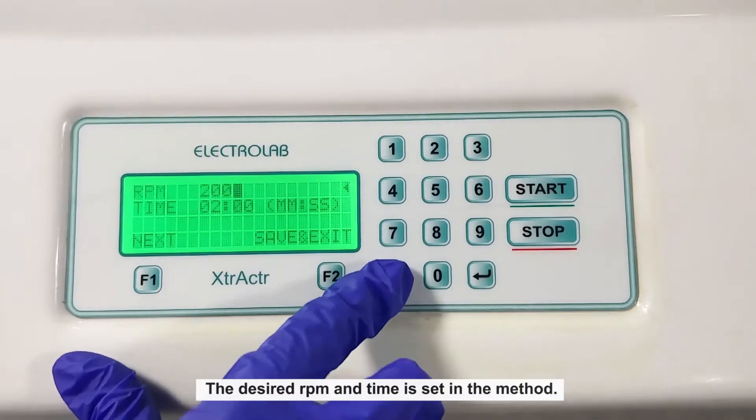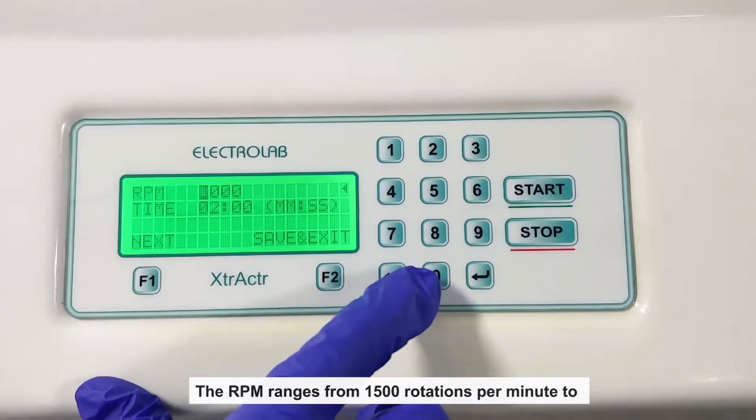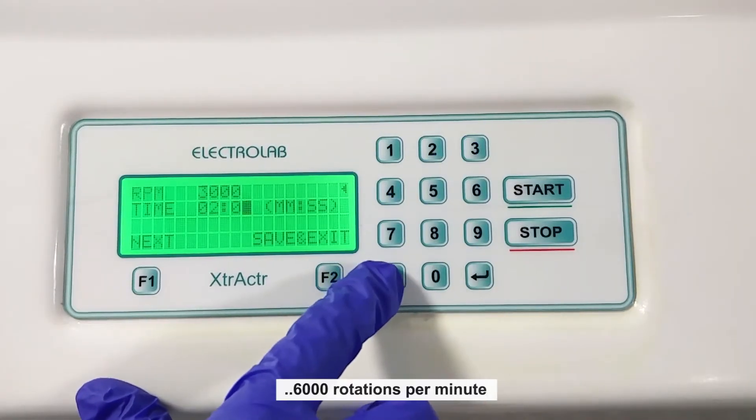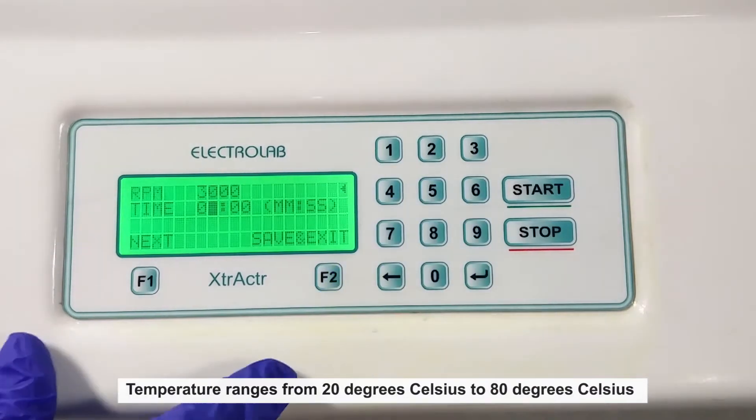The desired RPM and time is set in the method. The RPM ranges from 1500 rotations per minute to 6000 rotations per minute. Temperature ranges from 20 degrees Celsius to 80 degrees Celsius.